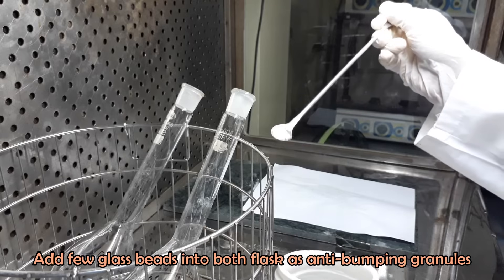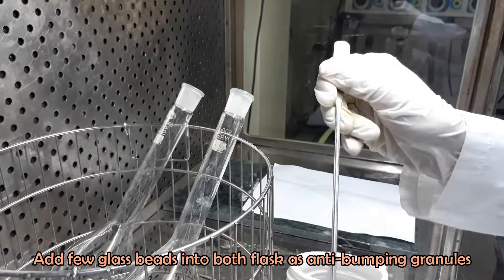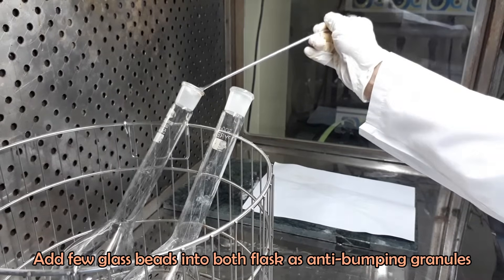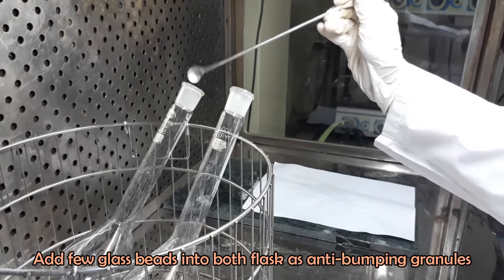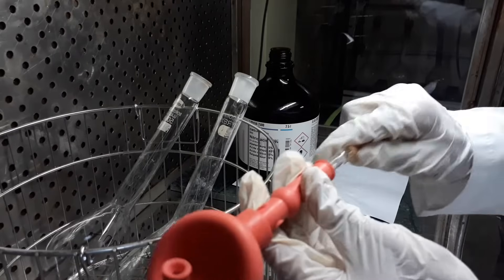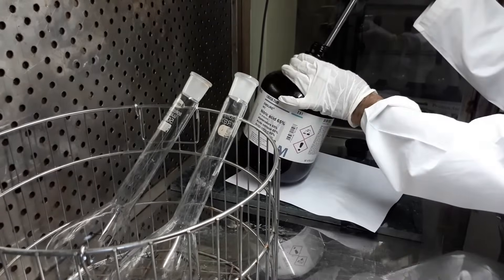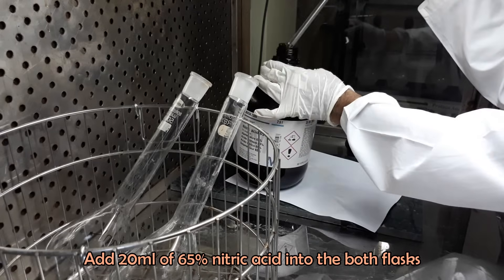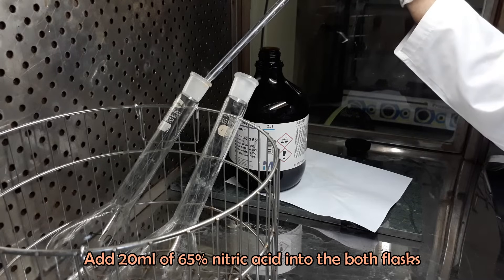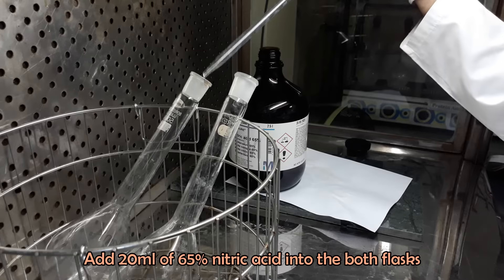Add a few glass beads into the flasks. Now add 20 ml of 65% nitric acid into both the sample flask and the blank flask.